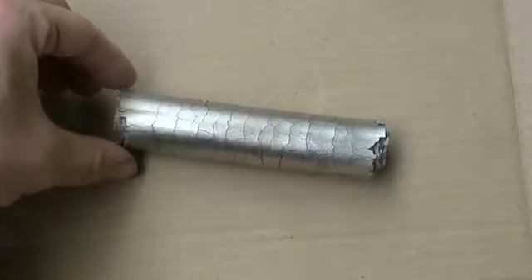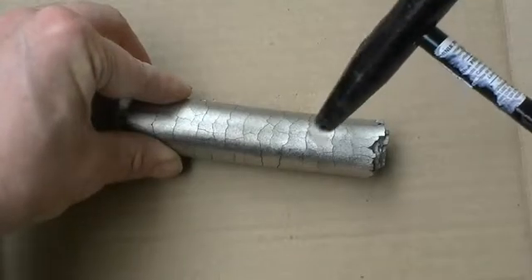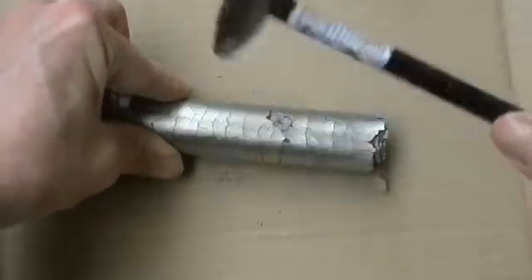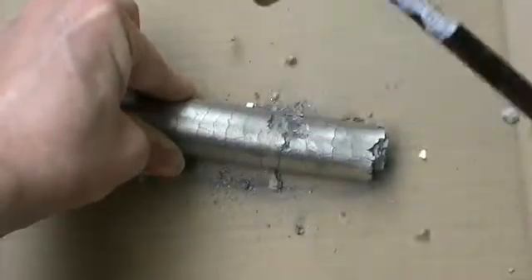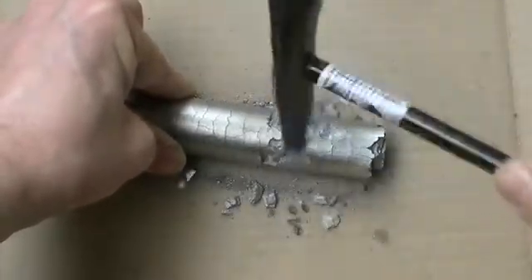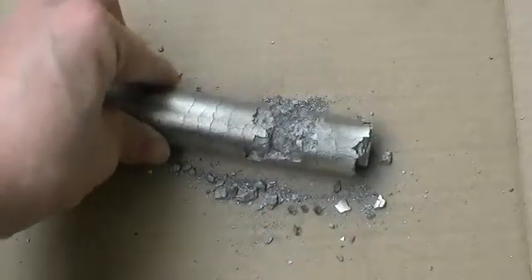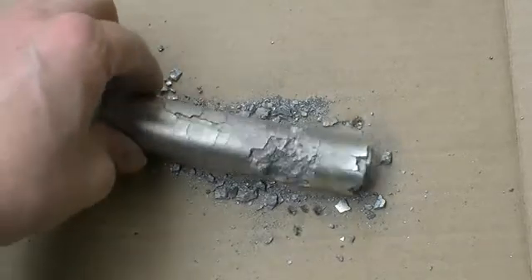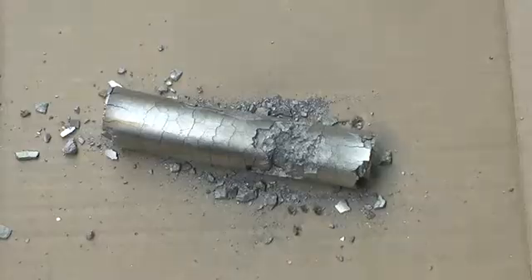Titanium can actually absorb up to 3 weight percent hydrogen gas. However, this absorption of hydrogen embrittles the titanium. As we can see here, as we tap a rod of titanium which has been exposed to hydrogen gas at elevated temperature, we can see that the titanium literally fractures. This is an extreme form of hydrogen embrittlement.